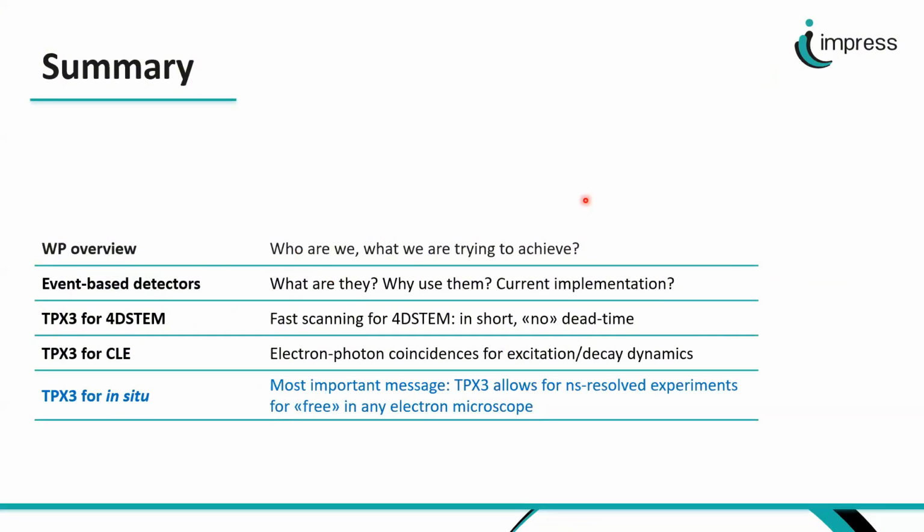Yes, I still have time for other experiments that we are doing in parallel to IMPRESS. It's not exactly inside the proposal, but something that came to us a bit by chance late last year. It's another research area that we have here in the LPS: we do PINEM, photo-induced near-field electron microscopy, and EEGS, electron energy-gain spectroscopy. For these two techniques, what we need is to couple a laser beam into the microscope and make it interact with the electron beam, mediated by the sample. So we can actually exchange energy between the electron beam and the laser beam using the near field of our sample as a mediating source.